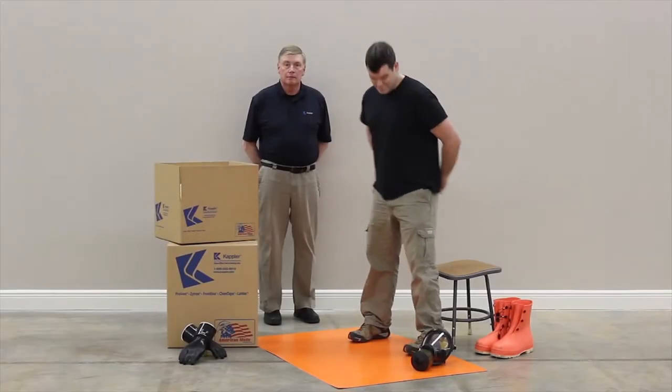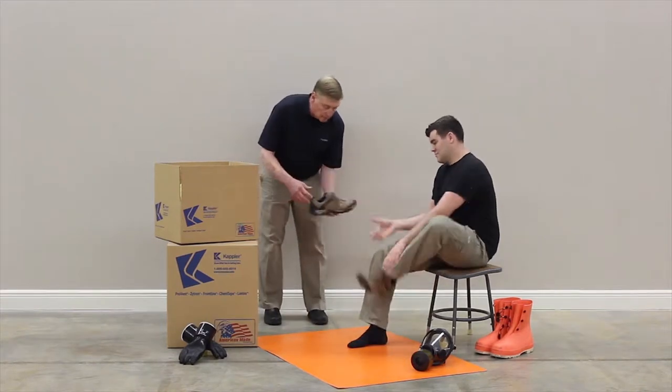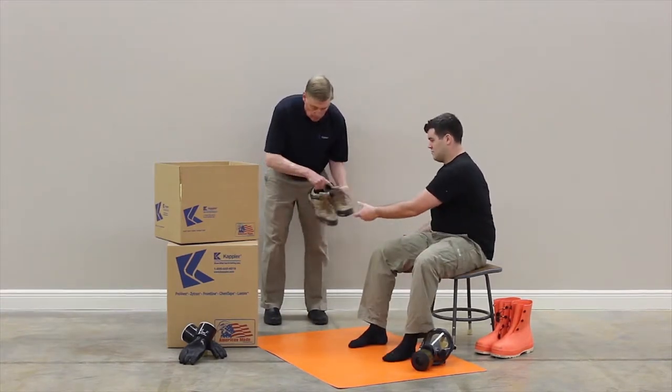Before donning, remove all jewelry and personal items that could damage the garment. Remove your shoes.